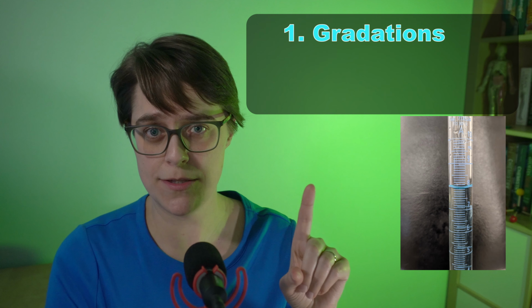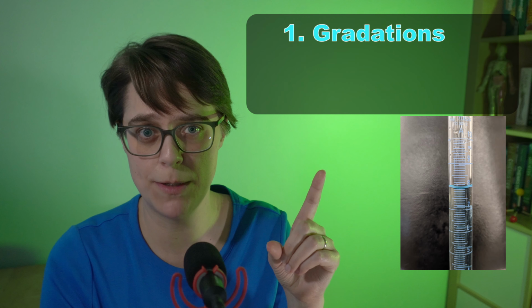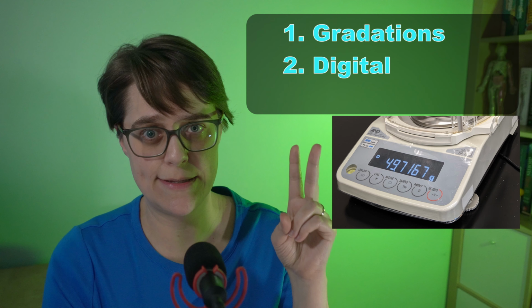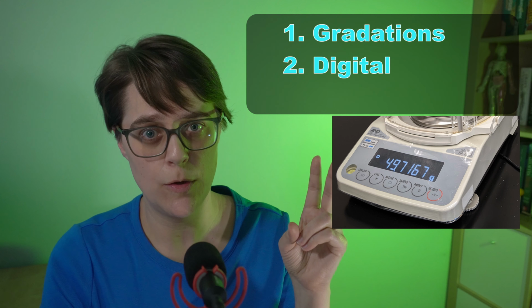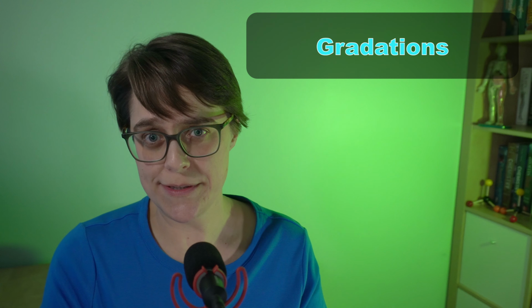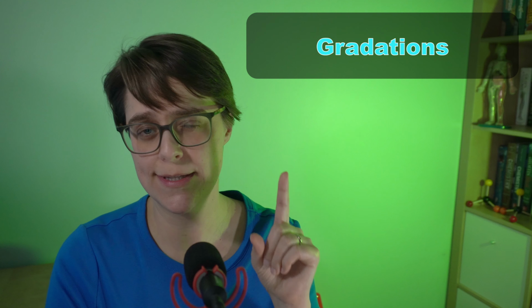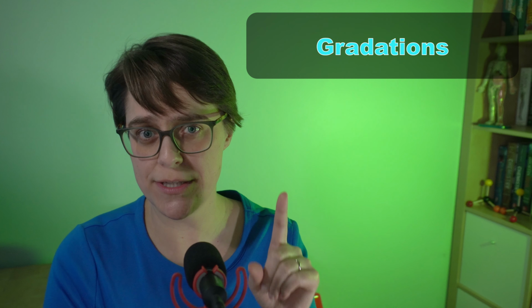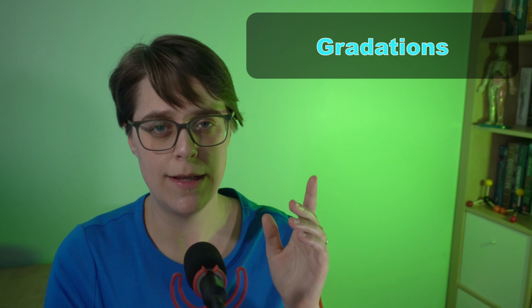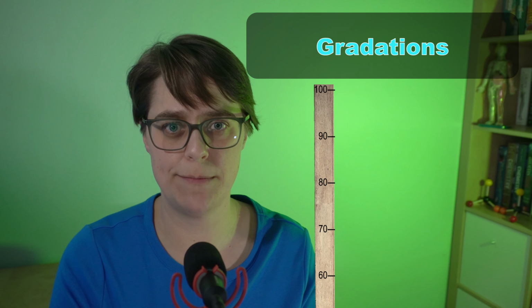The uncertainty of a measurement generally falls into three different categories. If the instrument has gradations, like a measuring tape, a glass pipette, or a glass thermometer, if the instrument has a digital readout, or if you are counting objects. For an instrument with gradations, estimate one more digit than there are gradations and assume that that last digit is plus or minus 1.